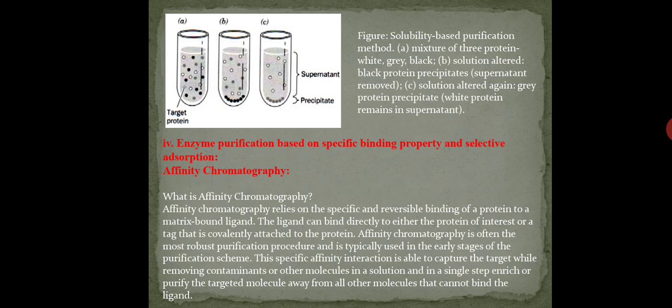Instead of interacting, they think that water and salt are interacting, so why should we stay alone, so they decide to come together and they interact with itself. And water molecules along with the salt start to create a shell along the protein.